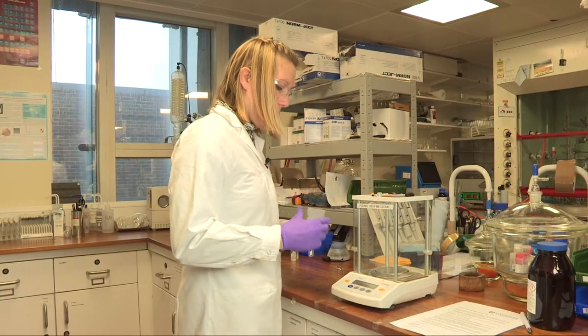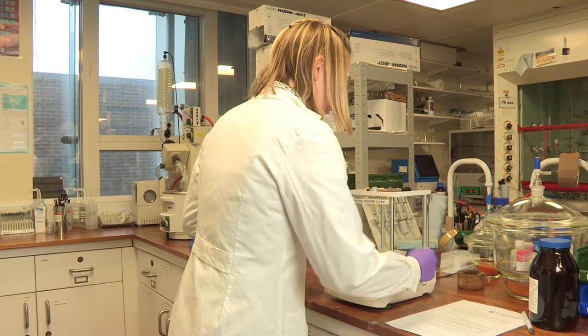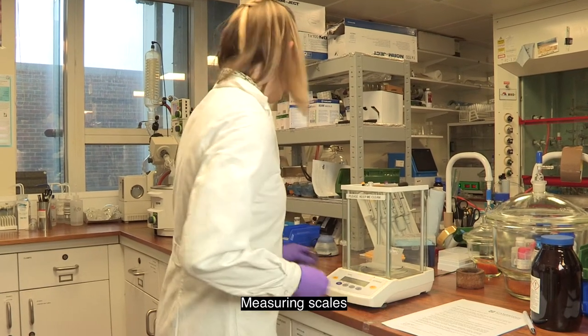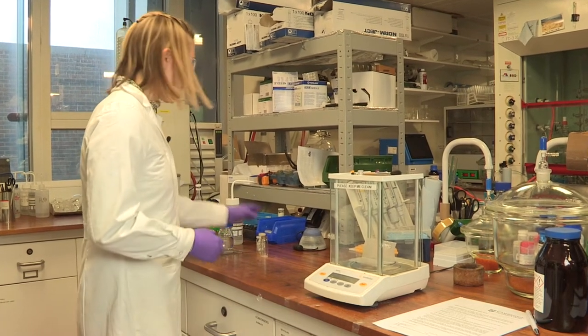Right now I am just going to weigh my photocatalyst. A scale is definitely one of the most common equipment you'll see in any sort of lab — always useful.